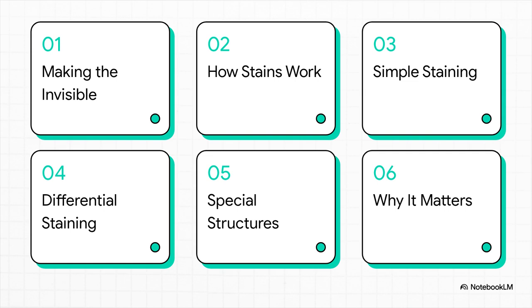Here's what we've got on the agenda today. We're going to start with this whole invisibility problem, then we'll get into the chemistry behind how we solve it, and finally, we'll check out the different staining tools that scientists have in their toolkit.